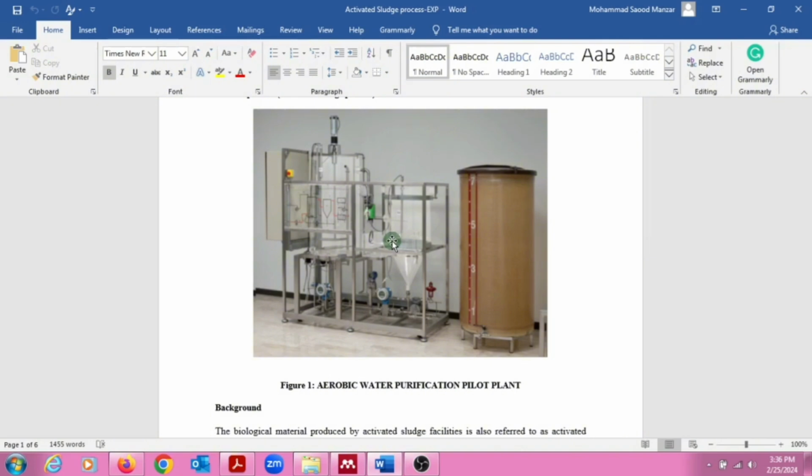Now the biological systems are basically dynamic systems that permit the removal of biodegradable organic content present in the sewage. Okay, and the sewage treatment here is a mixed microbial fermentation of the substrate to be removed, which often consists of a homogeneous mixture of components and also of the microorganisms connected to the process, which are mainly mixed colonies of different kinds of bacteria like saprophytes, which break down the decaying organic matter. Basically the BOD, or the organic matter present in the water, is converted into CO2 and H2O.